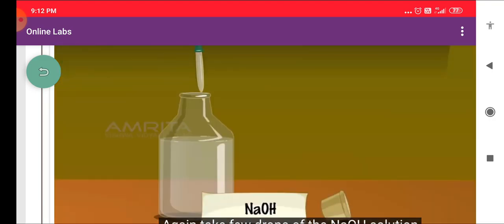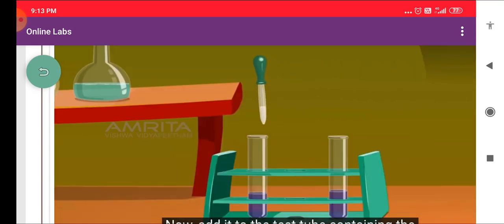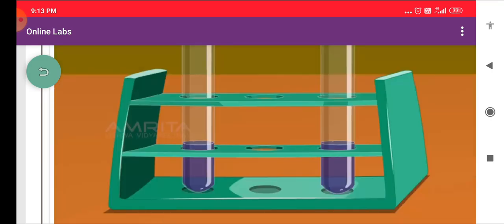Take a few drops of the NaOH Solution from its bottle using the dropper. Add it to the test tube containing the Blue Litmus Solution. The color of the solution remains the same.